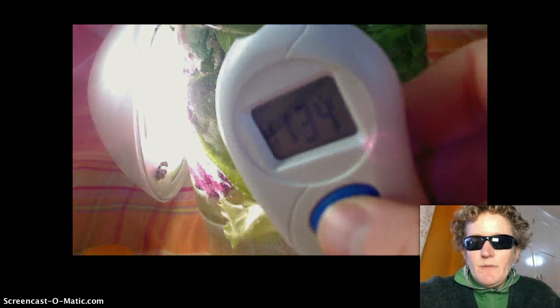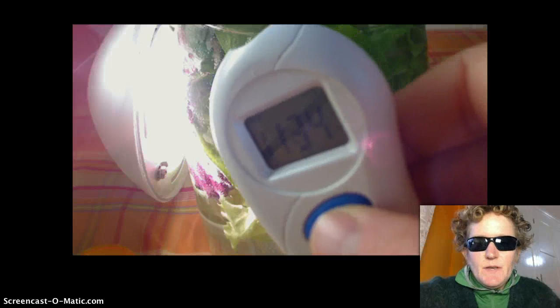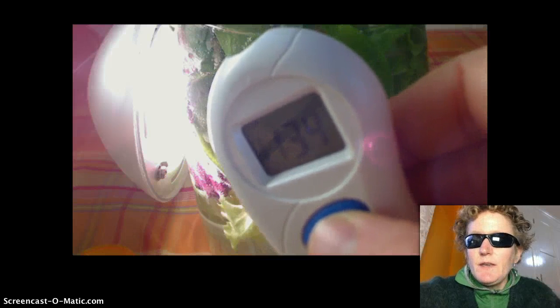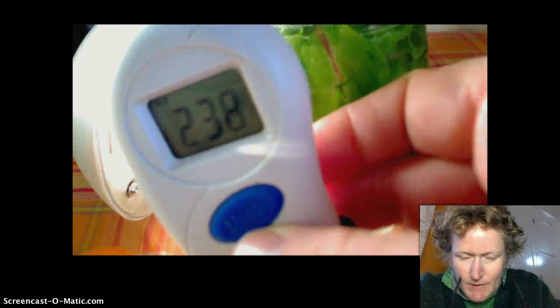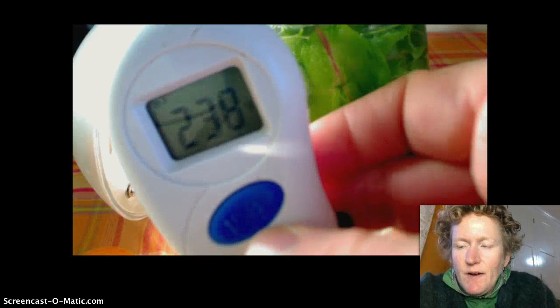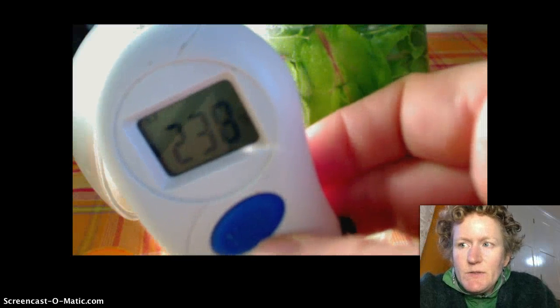Here I have an infrared thermometer that takes the temperature of things without actually having to touch things and I'm going to take the temperature of the surface of this light here that's up against the jar. You can see that it's pretty darn hot. It's 238 degrees Fahrenheit. That's pretty toasty.